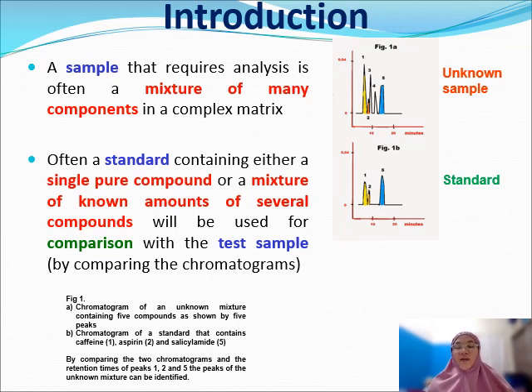Retention time dia sama, dia keluar pada waktu yang sama dengan standard keluar. So kita boleh conclude that our samples, okay, now is contained with that kind of compounds. Okay, so that is how we want to analyze our sample using chromatographic technique. This is example of, I'm sure this is HPLC lah.